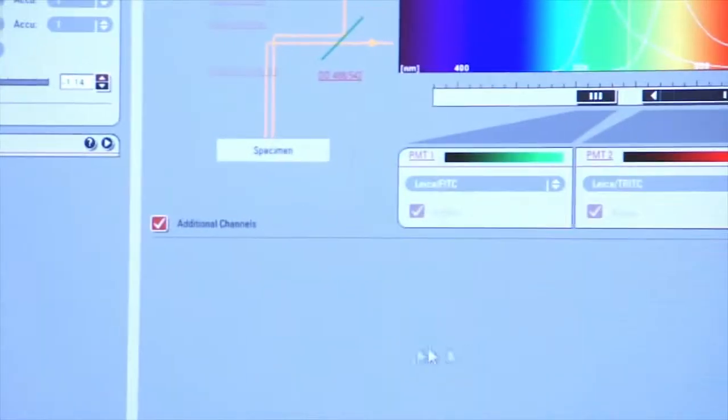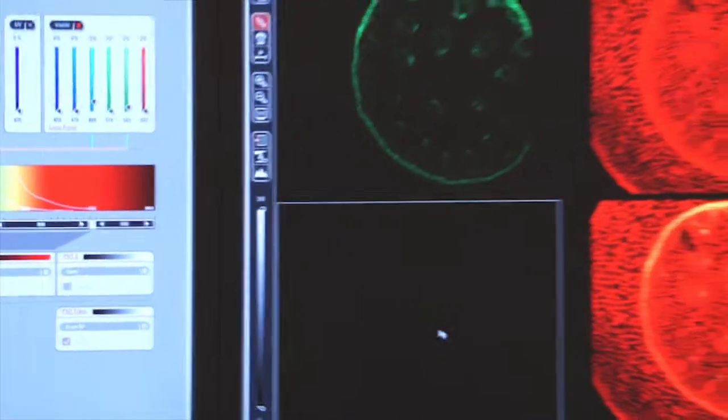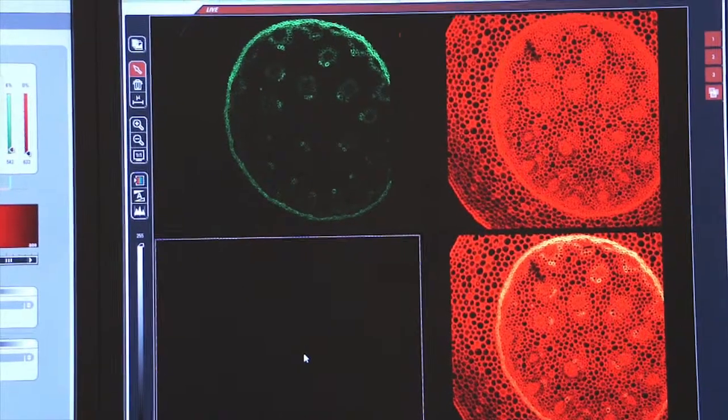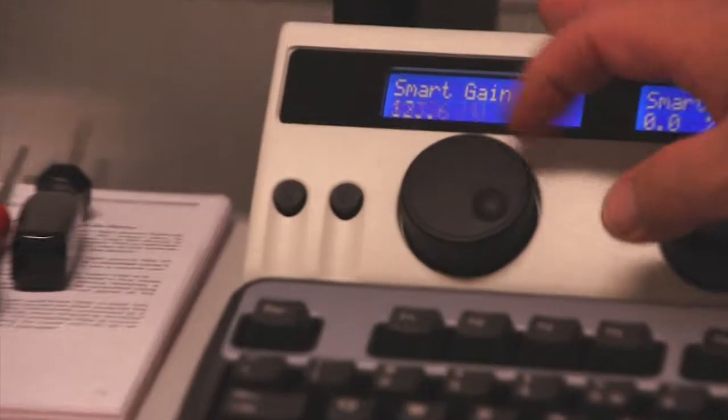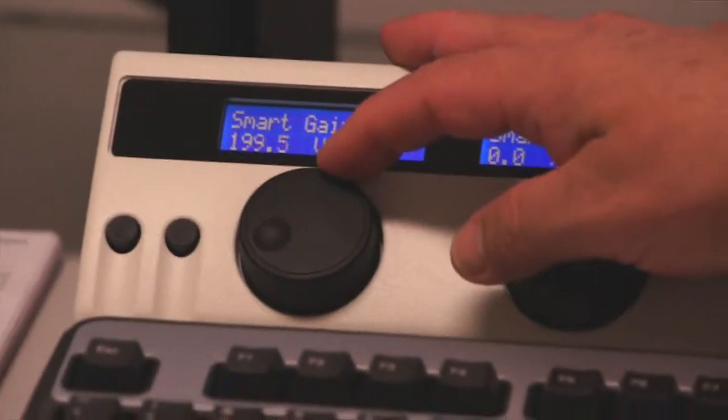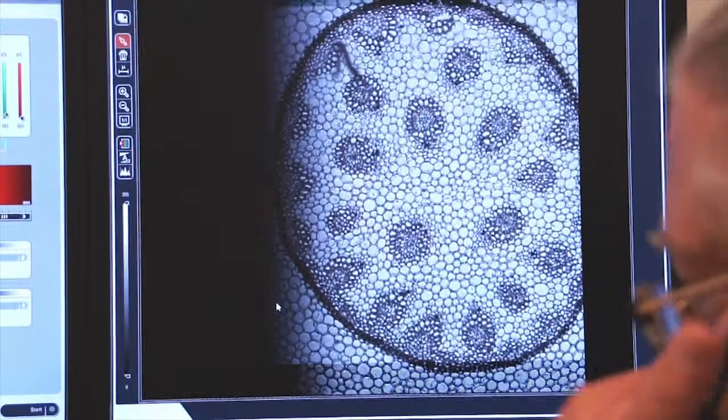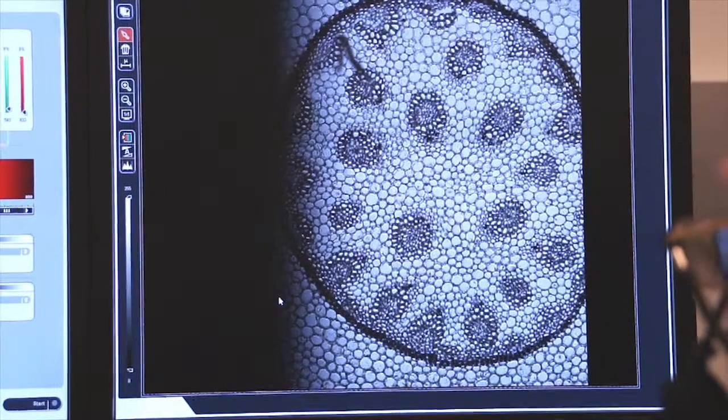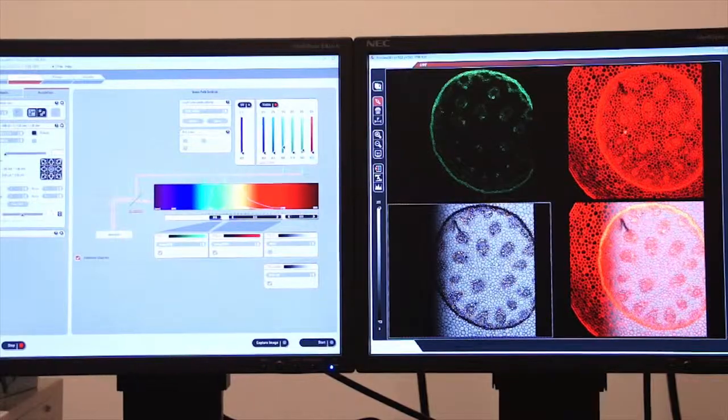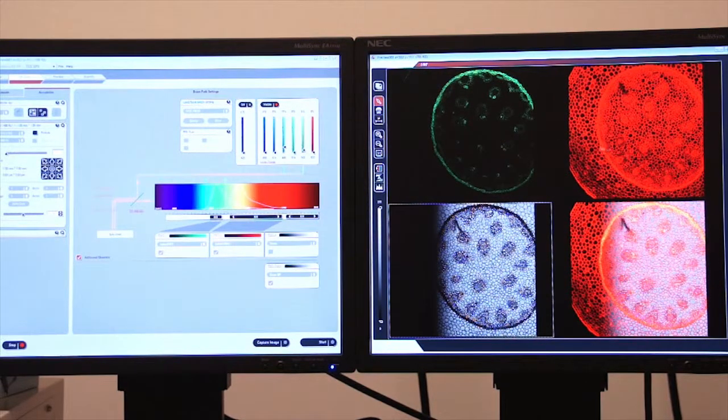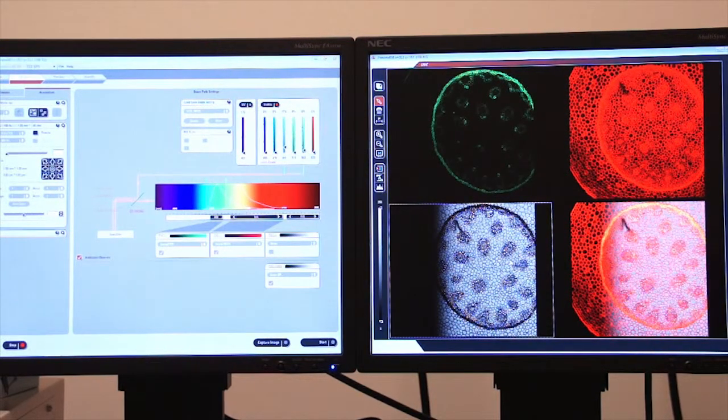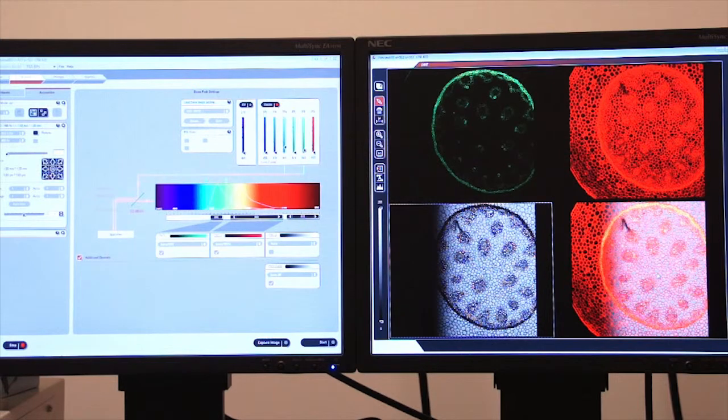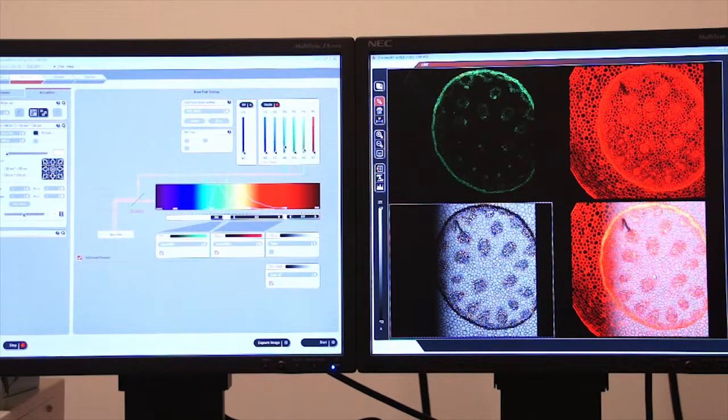I'm now collecting three different images but the bright field image you can see is very dark. Let's double click on that and my smart gain is very low. So I'm going to increase my smart gain until I start to see my transmitted light image. I can also control the offset so that I get good contrast. Now I have a combination of three images including two fluorescent images and a bright field image that are output to my screen.